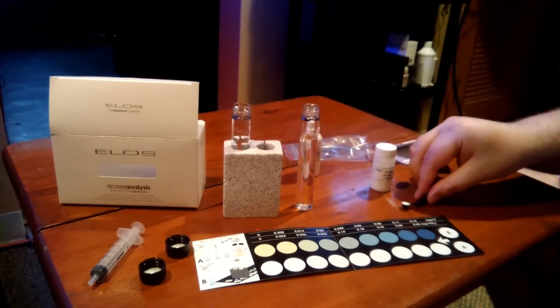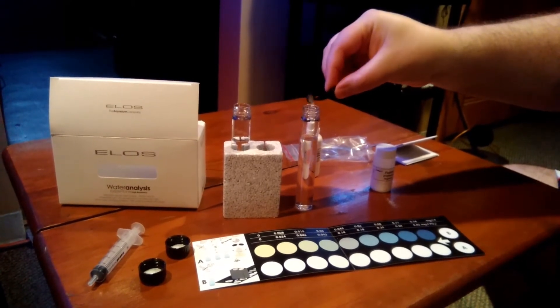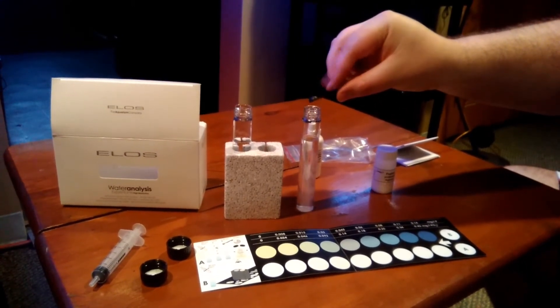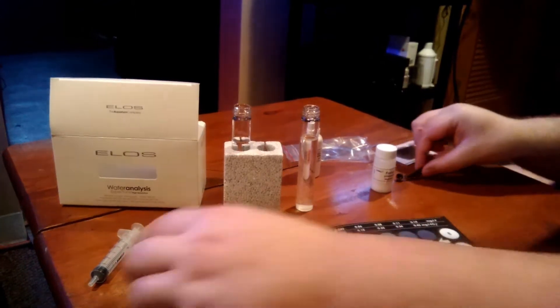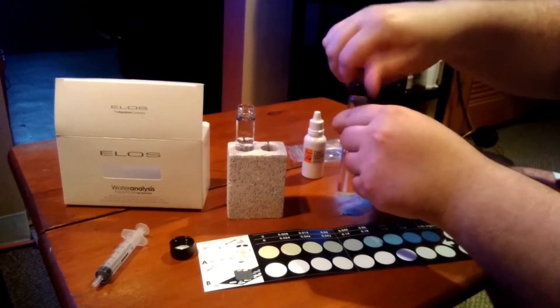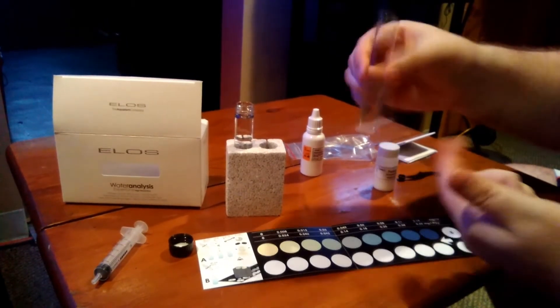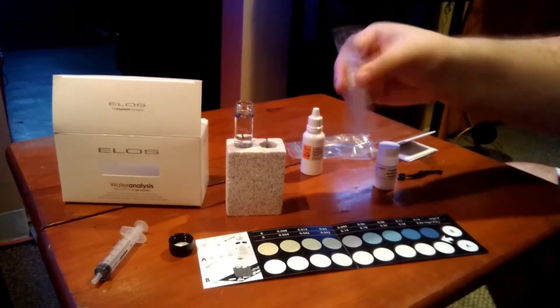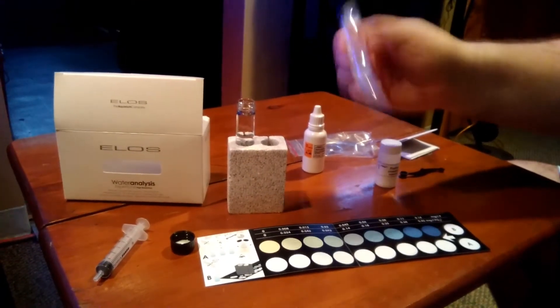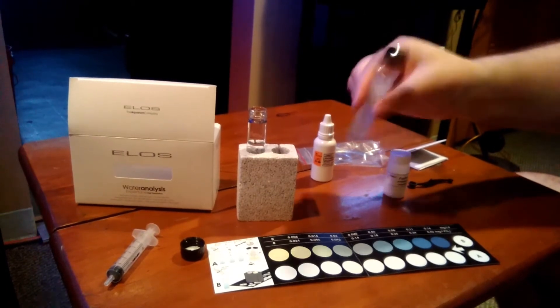Then you're going to take your powder and dump that in there — pretty easy. You're going to take your cap, put that on there. Shake it up — you can see how it settles at the bottom — so you want to shake that up and get it all mixed in nice, because you can't do your test until it is.